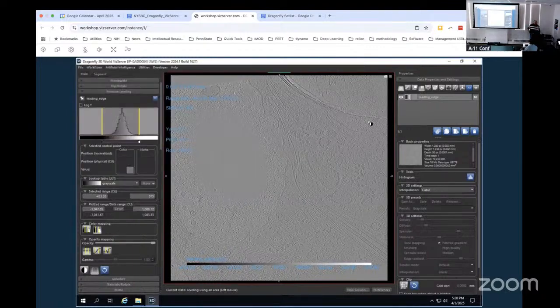So what do you need to know? I closed this window and I don't think I saved the object. Okay. Don't worry, I already have it saved for you. You don't have to worry about it. I'm just trying to show you the mechanics of this up front so that when you go back home, if you want to use this, it's not going to just be a bunch of weird mysteries.